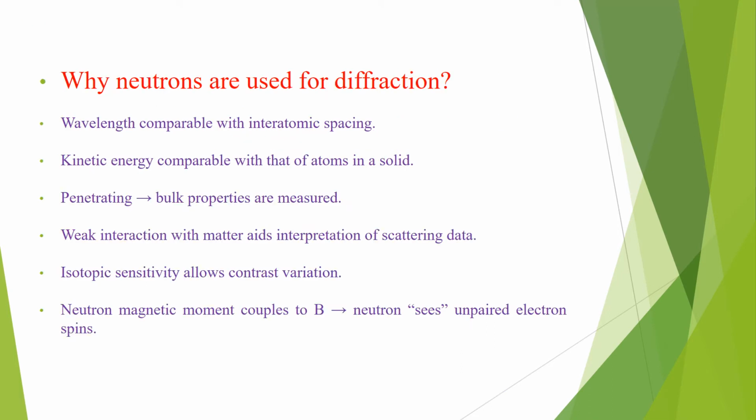Dear student, here we will learn why neutrons are used for diffraction instead of X-rays and other sources.